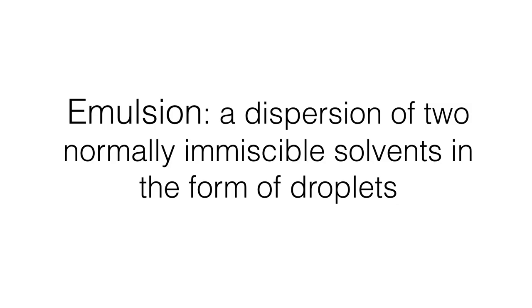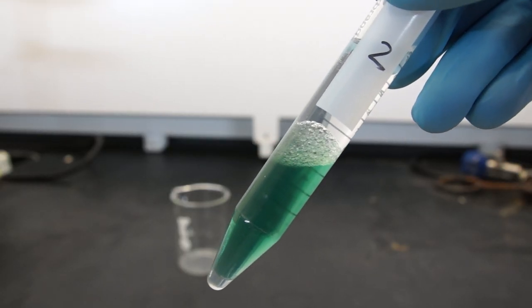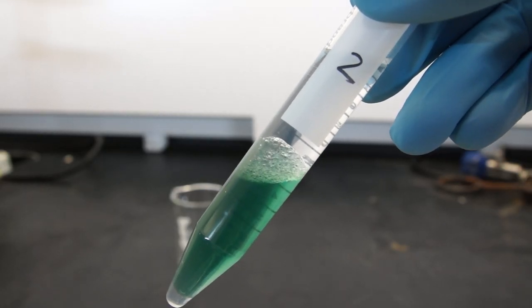Sometimes during extraction, you might get what's called an emulsion—a dispersion of two normally immiscible solvents in the form of droplets. If you have an emulsion like we have here, you want to try and clear it up.